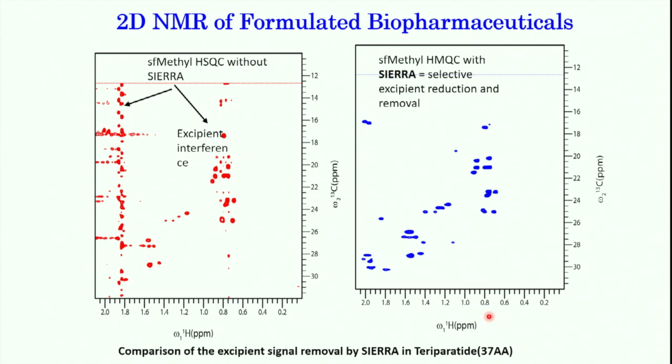But remember here what we have done. We have shifted the equilibrium by acidifying from pH 7.4 to 2.3, which shifted the equilibrium from hexameric state to the monomeric state. Okay. So we will address this a little later.